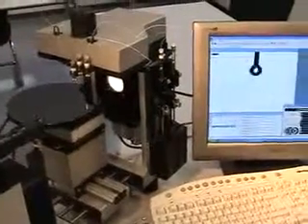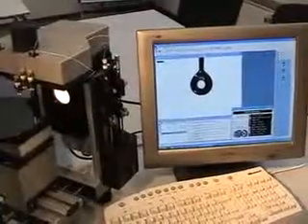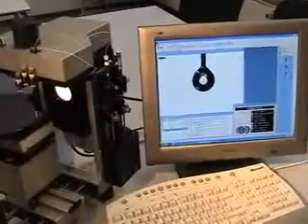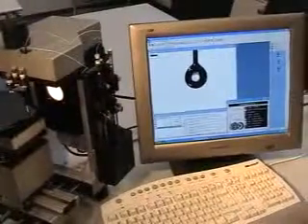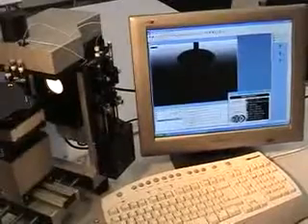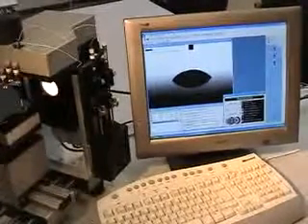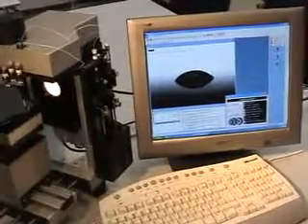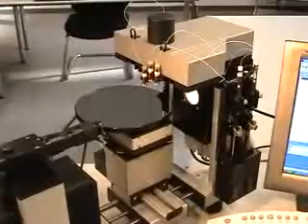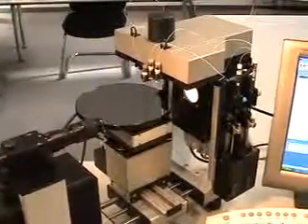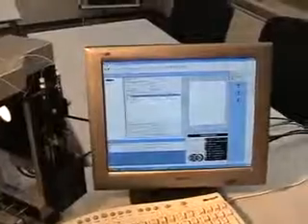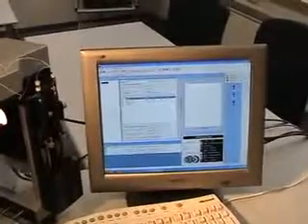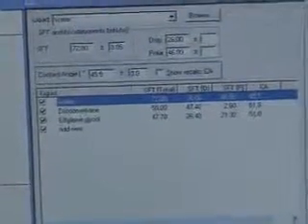So we have no interaction by the user. It's completely free of influence of human error. During the measurement, automatically another window has been opened. This is the surface energy calculation window. Because we have to find three liquids to use for the surface energy determination.